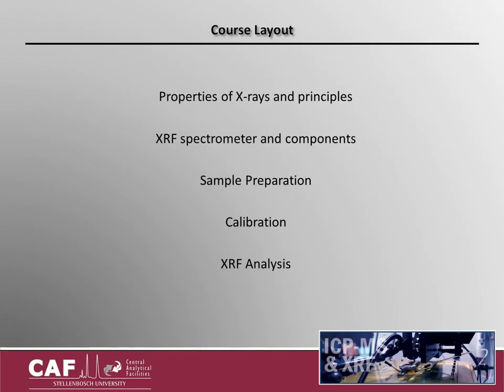Welcome to the XRF Spectrometry course. During this presentation, we will cover the basic concepts of understanding XRF spectrometry. We will start with an introduction into the physical properties of X-rays and how these properties form the core principles of XRF spectrometry. Once the physics behind the XRF analysis is covered, we will investigate all the different components of the spectrometer.